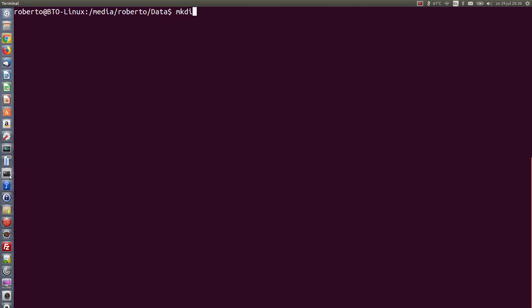Then we create a folder, and the name doesn't matter. It's your choice. In this case, also your choice.